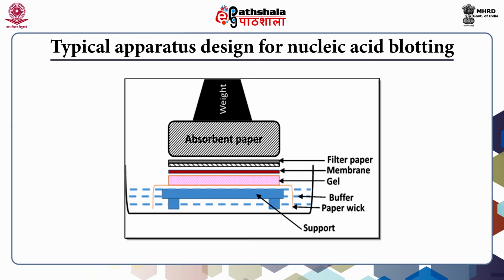Since solvent flows upward through capillary action, all portions of Whatman paper, gel, and membrane must be kept wet, and air bubbles should not be trapped while layering over each other. For success of transfer, Whatman paper larger in size than that of the gel is cut and immersed in buffer and then placed over the support. Only edges of Whatman paper should dip in buffer. The gel is placed upside down on Whatman paper.